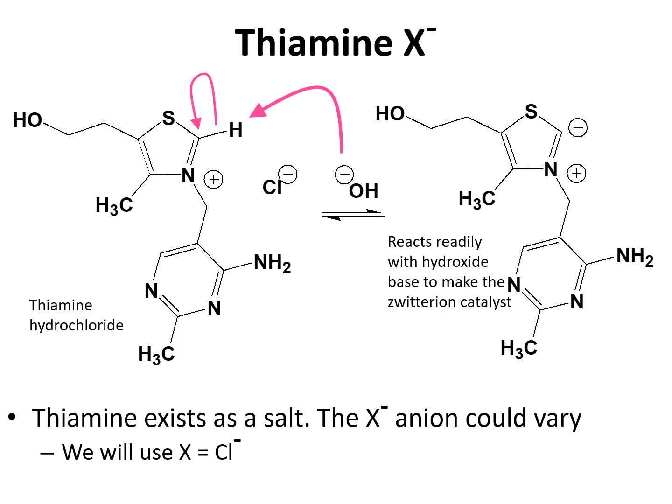So what happens is, when thiamine reacts with sodium hydroxide, because in the experimental part you'll see we'll be adding a base into the reagents, the base abstracts a proton from thiamine.